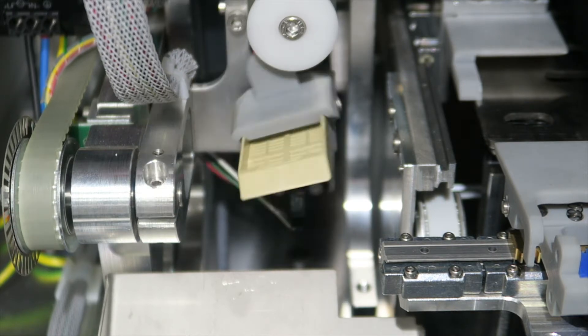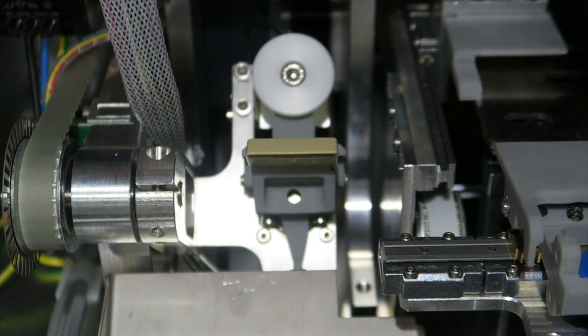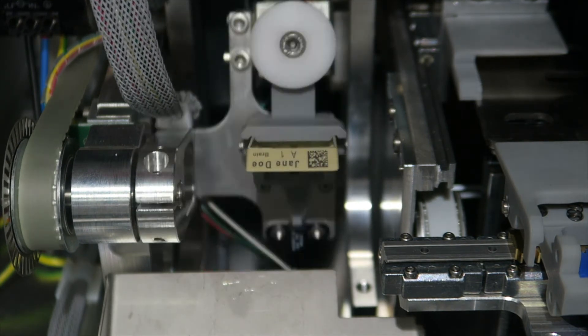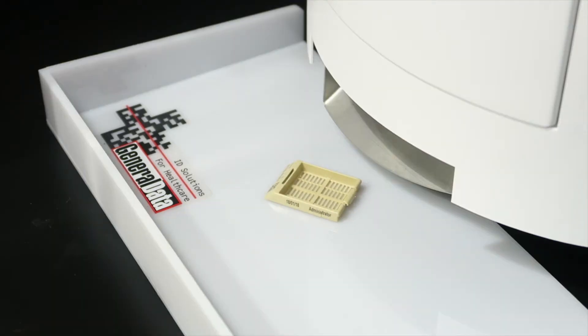The LaserTrack PH-8 has text, linear, and two-dimensional barcoding capabilities. It prints tissue cassettes using innovative laser technology that creates the precise, clean edges needed for scanning and decoding the small 2D barcodes used on tissue cassettes.